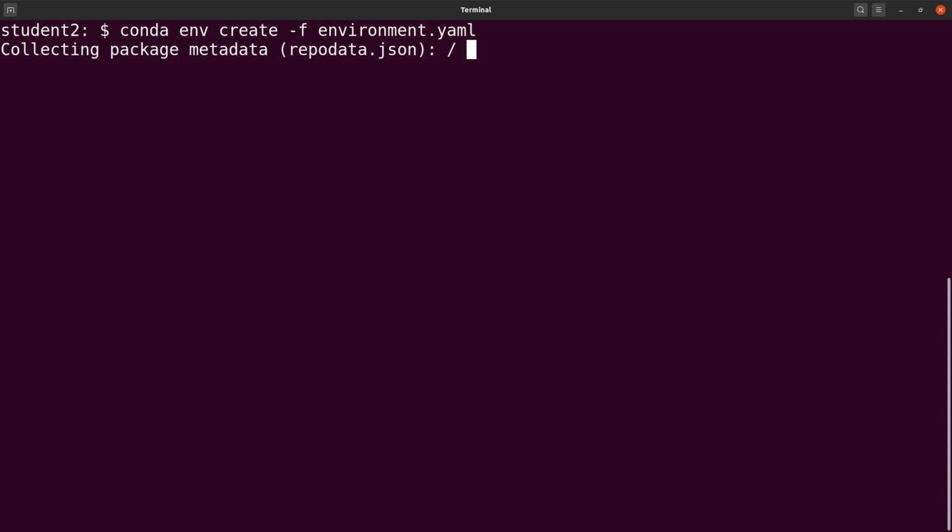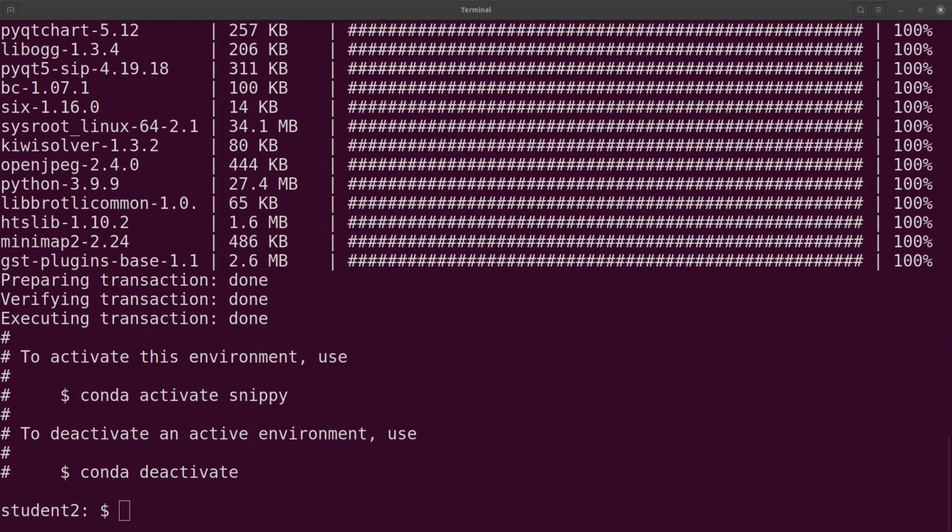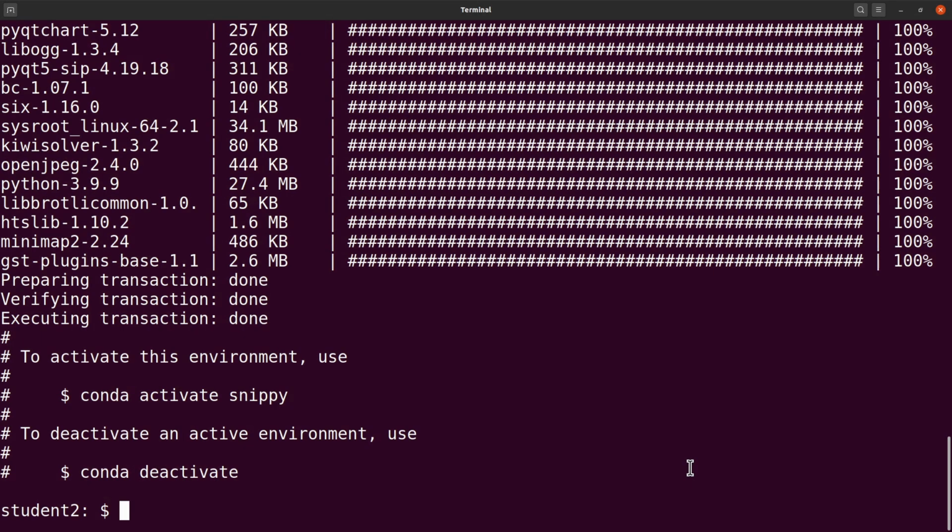With this particular command to install, it might take some minutes. I think when I tried once it took about 20 minutes. So just be patient whilst it loads and installs everything for you. Let's wait and see how it goes. Okay, so the tools have been installed. Let's first clear the screen and continue.